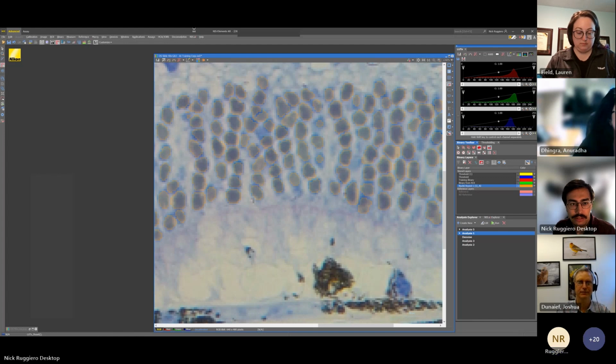Saving. Oops. All right. It did not like that. I think I was playing with that file. It may have been corrupted at one point. So I'll open that back up.